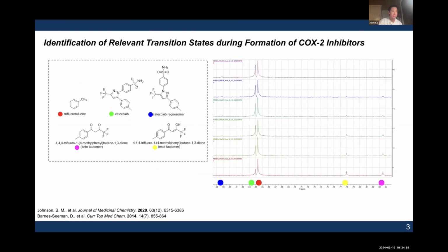Over a couple months, we gathered the data pertaining to upwards of 1,000 NMR samples, from which we were able to discern two interesting details. The first is that, as shown through the time course to the right here, there seems to be no slow-step intermediate in the postulated mechanism, with the rate-determining step being the initial attack of the primary amine on the 3-carbon of the diketone.